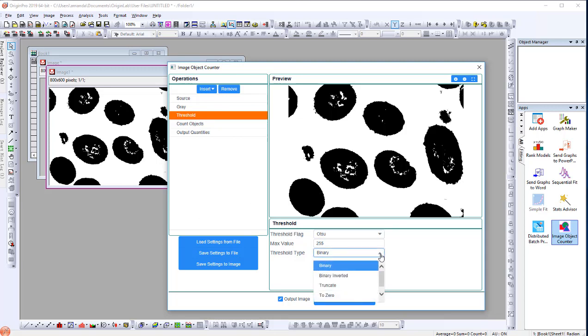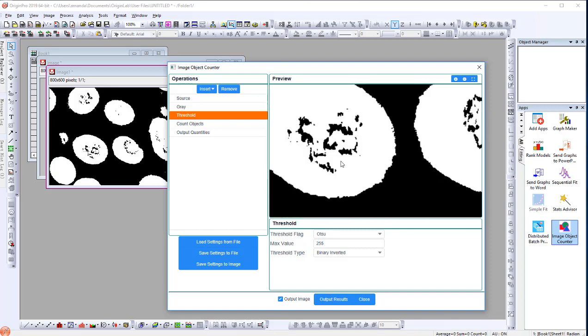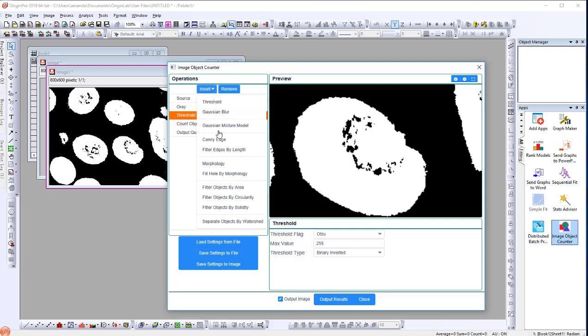On the Threshold panel, change Threshold Type to Binary Inverted. There are some empty spaces inside each cell. You can scroll the mouse wheel to zoom in the preview if needed. To fill the holes, simply choose Fill Hole by Morphology.